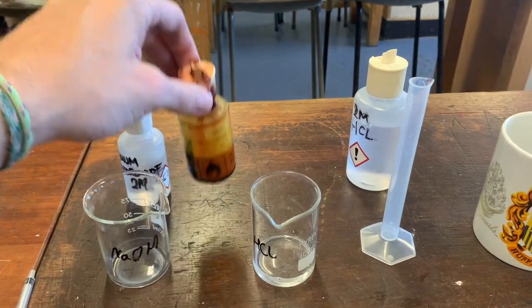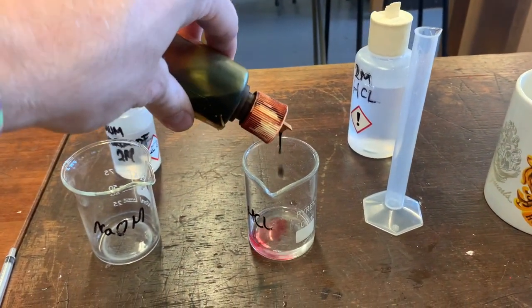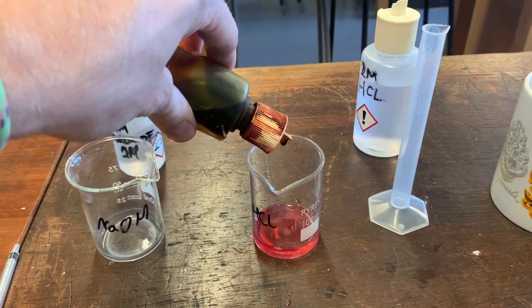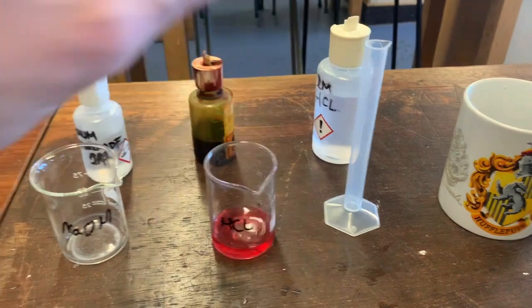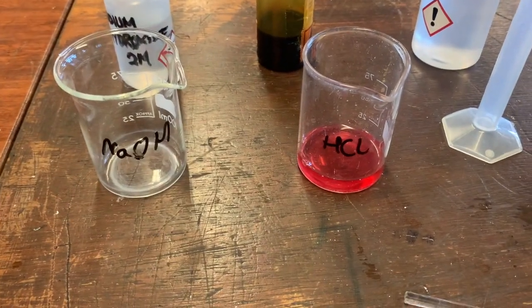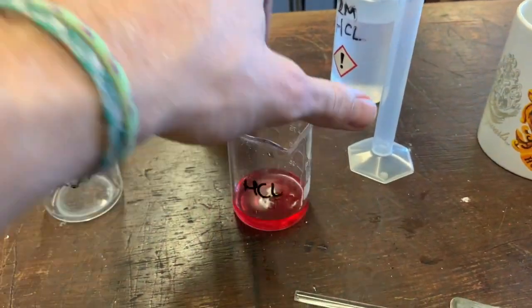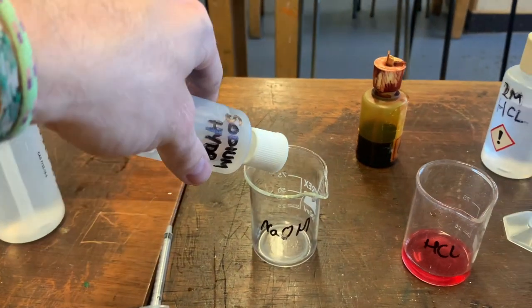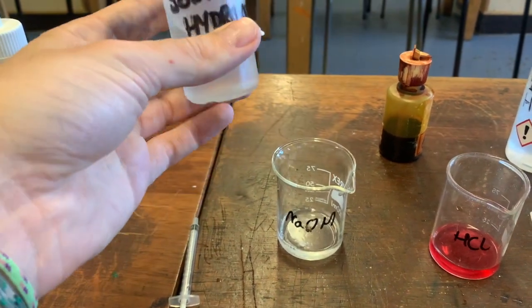First of all, I'm going to pour this acid into my beaker, then take the universal indicator solution and add just a few drops to get a nice strong color. We can see that this has a very low pH — probably around zero.